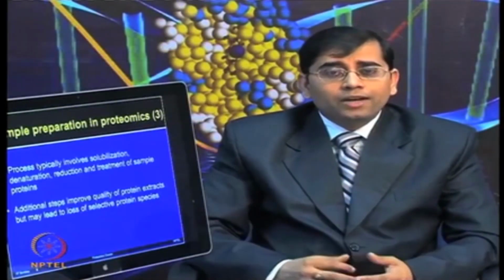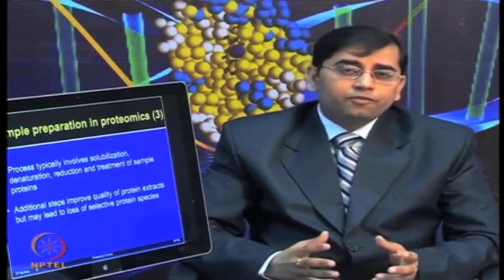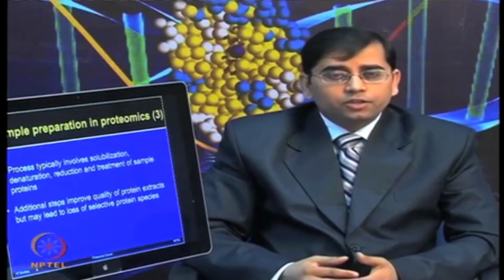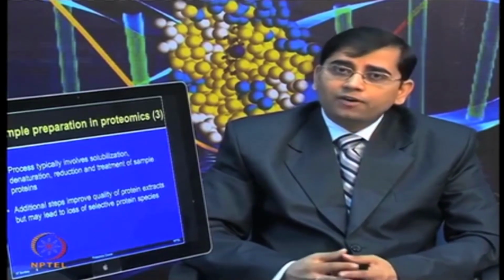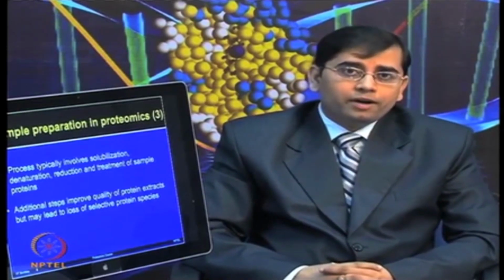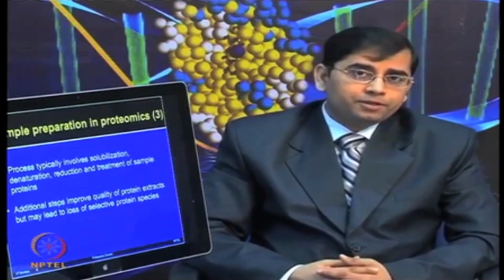And while you are doing this, you have to be very cautious that when you are performing various steps and sequential type of extraction, you may also lose a small fraction of the proteins. So, one has to be careful when adding various additional steps during the sample preparation.